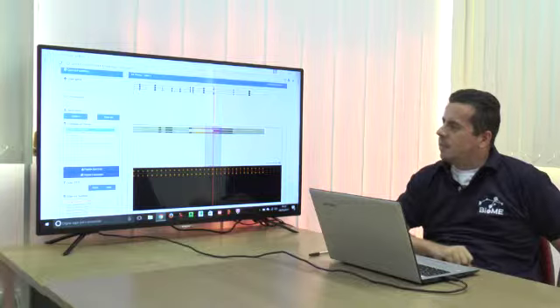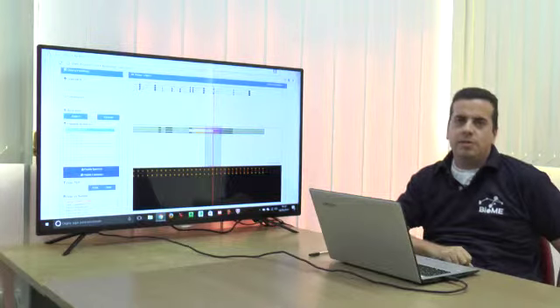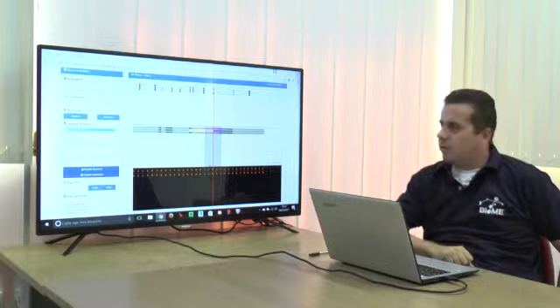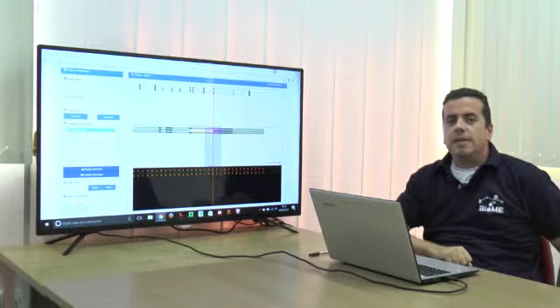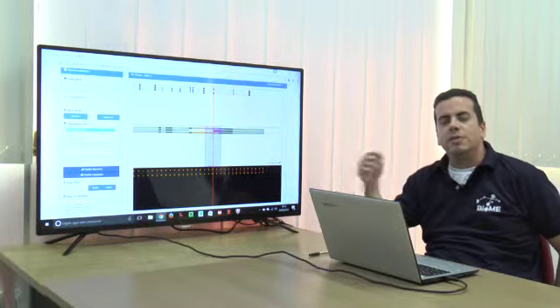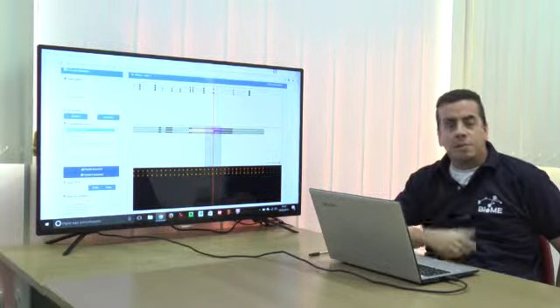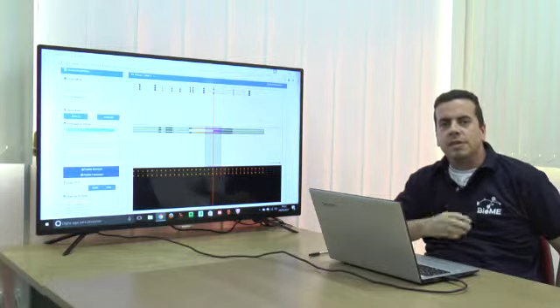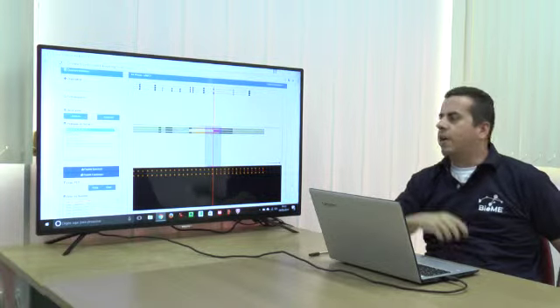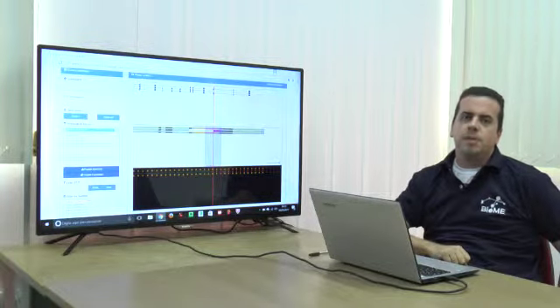Proteogenomics is an approach in which you can use peptide sequence information, mostly collected using proteomics approaches, to align it to genomic information in order to improve genetic models. For example, you can use the peptide sequence to validate whether a coding region of a genomic region is coding or not, or you can use peptide information to characterize splicing events and different protein isoforms.